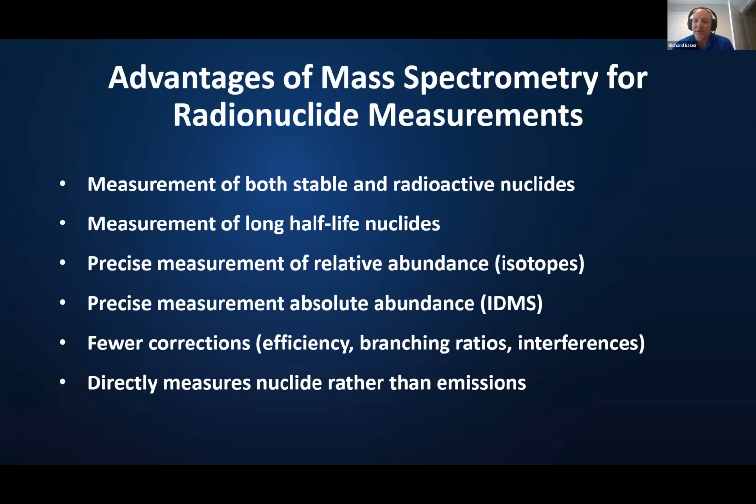Where obviously for something like gamma spectrometry, my dog is announcing his presence. For something like gamma spectrometry, you may not need to do any sample prep at all if you're just doing a bulk measurement.